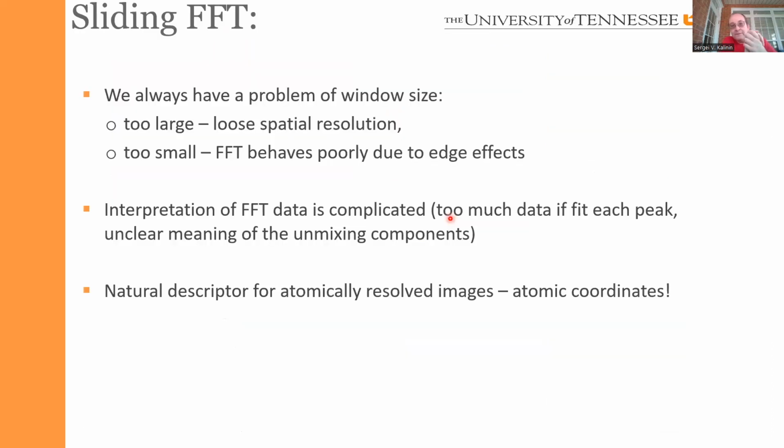So this being said, the sliding transform, where we take the image, apply the FFT, and then apply the linear unmixing method, is actually a very powerful method. It instantly gives you some insight into the properties of the object. It is very powerful, it is stable, and it is robust. So if you run the sliding FFT PCA on an image, it will always work.